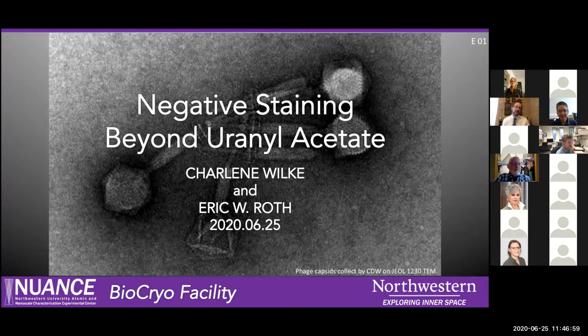You can use gold as well. I haven't, because it's a little bit more expensive than nickel, but they both work pretty well, I believe. I think they have pre-made, coated gold or nickel grids, but you can also make your own. If you have gold or nickel grids, you can create a carbon or Formvar coated grid yourself. It's a fairly easy technique, so you can either purchase them or create them yourself.